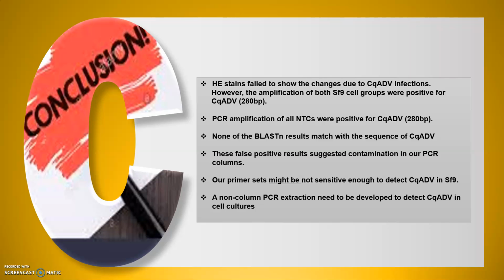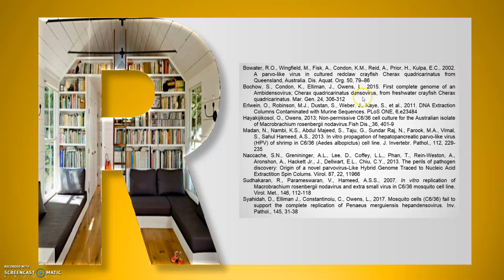Our primer sets might not be sensitive enough to detect CqADV in SF9. A non-column PCR extraction needs to be developed to detect CqADV in cell culture. These are some references that we used in our study.